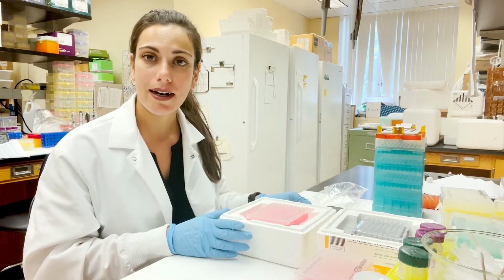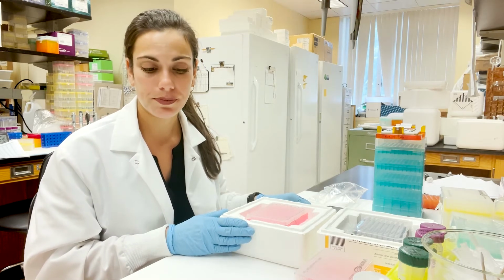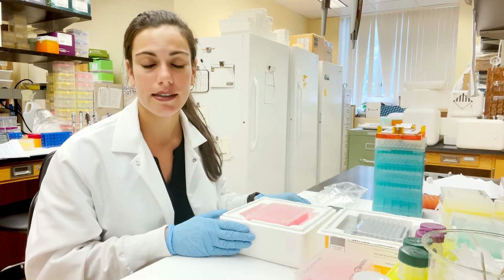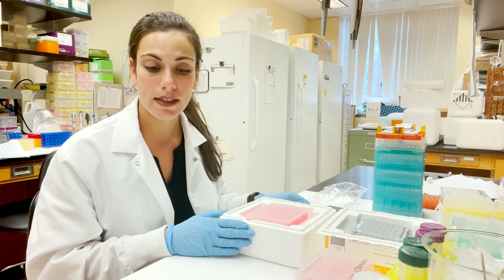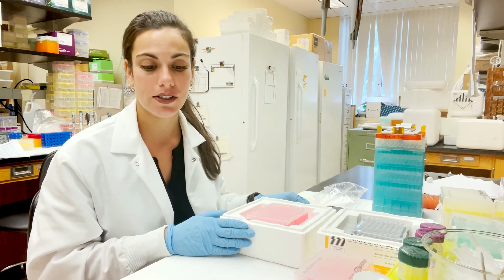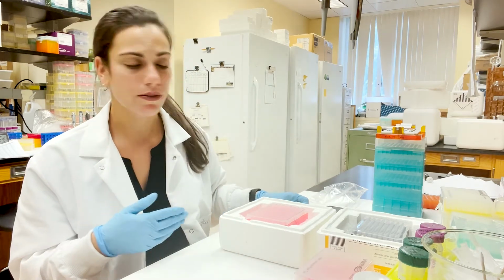Now the settings for this PCR amplification are 95 degrees Celsius for 30 seconds, 16 cycles of 95 degrees Celsius for 30 seconds, 62 degrees Celsius for 20 seconds, 68 degrees Celsius for 15 seconds, and then 68 degrees Celsius for 5 minutes, and then we hold at 8 degrees Celsius, but promptly remove.